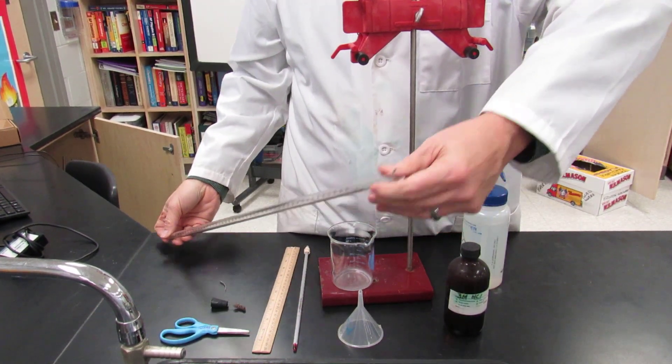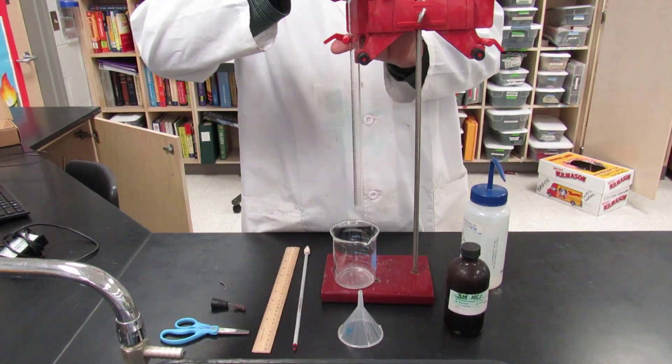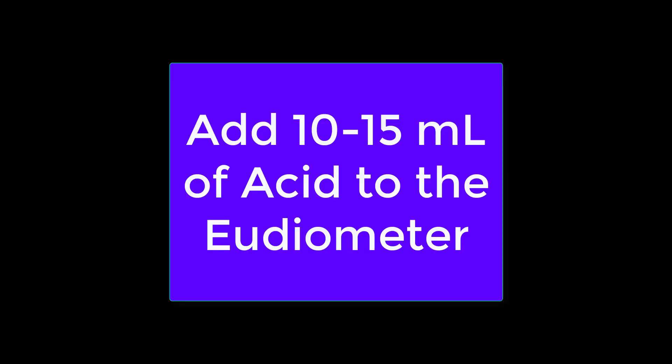The top end is open and it looks like a big test tube, but it's graduated. It has markings on it to tell you what volume it is from what is now the bottom up.